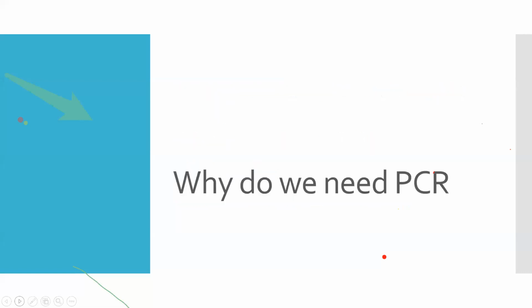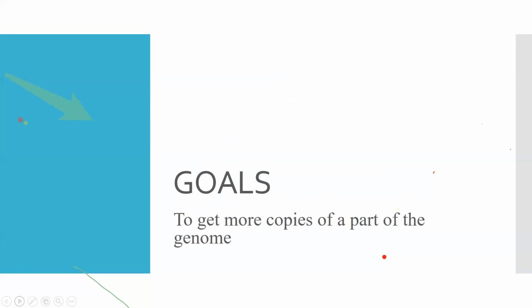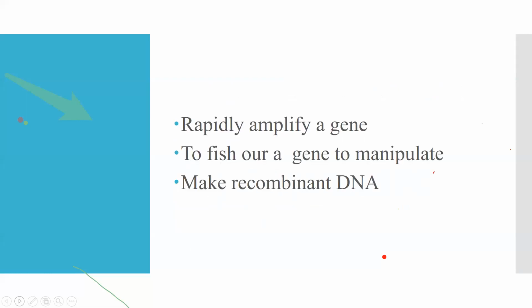Next is PCR. So why do we need PCR? Just like we were talking of making copies of a gene in cloning, PCR, you can say, is in vitro cloning. What helps is, first of all, PCR is a very rapid technology.